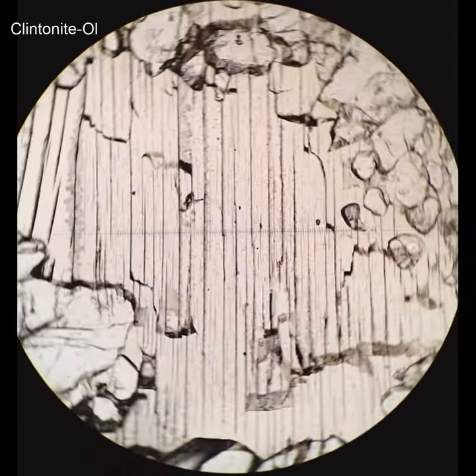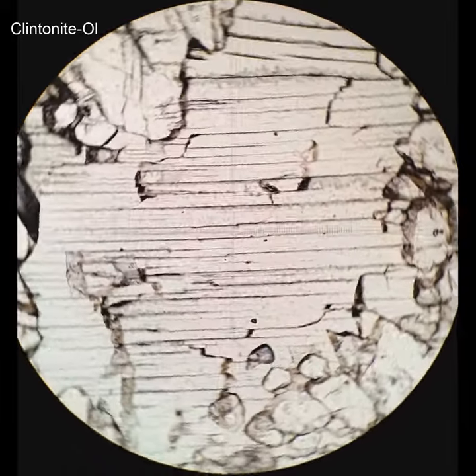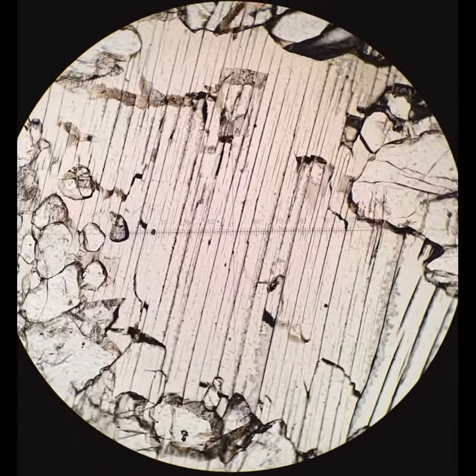And one last example, a little less pleochroic than the others, but still shows the same characteristics.